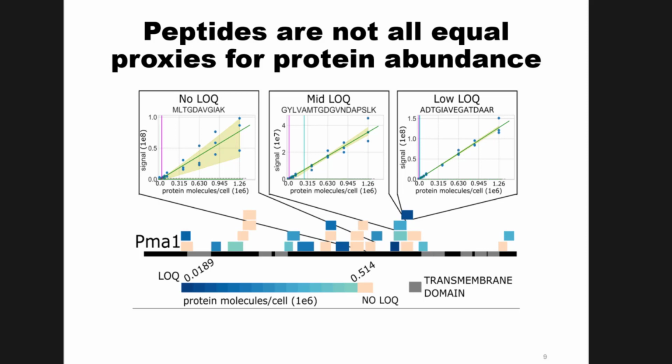Question in the back and then in the front? So one question is, if you have multiple peptides, like 50, do you do calibration for each of the peptides? And another part is, if you have multiple peptides from one protein, do you represent just one peptide? So each curve, each plot will be one peptide. You can mix all of those peptides into one calibration curve dilution set. I think Sue's going to talk way more about this later, actually setting these samples up. This is just to help emphasize why we're going to bother with doing calibration and validation.